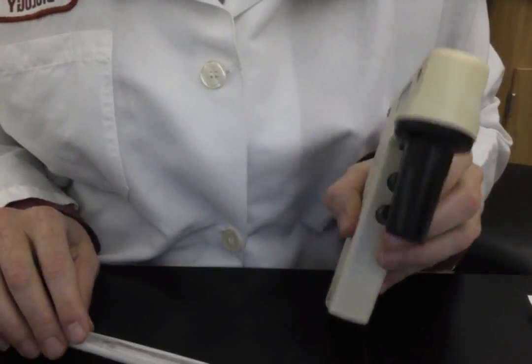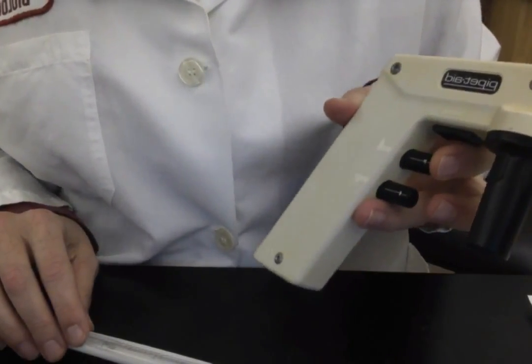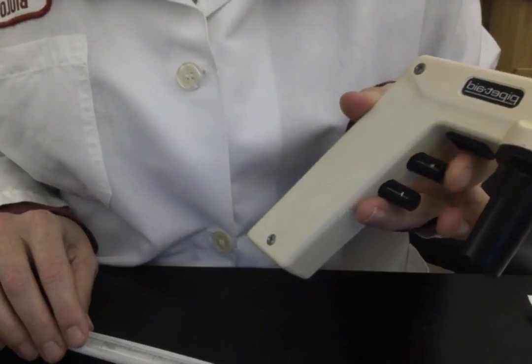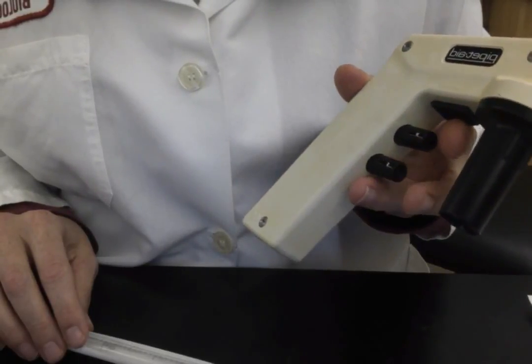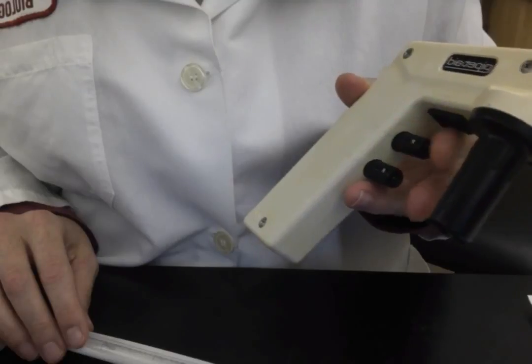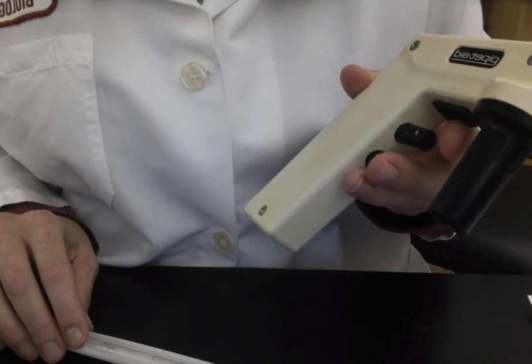This video is going to show you how to use an automated pipetter. The main things to remember are the top button is up, the bottom button is down. So the top button brings fluid into the pipette and the bottom button expels it.